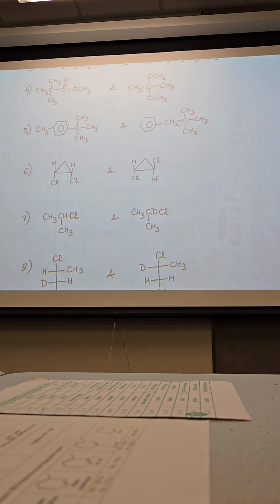Actually, even 5 looks good too. How about 6? By the way, what's the relationship between those 2 compounds and 6? They're diastereomers, cis and trans. Oh, okay, yes, you're absolutely right. Sorry, I wasn't looking carefully. They are absolutely diastereomers. They are cis and trans.